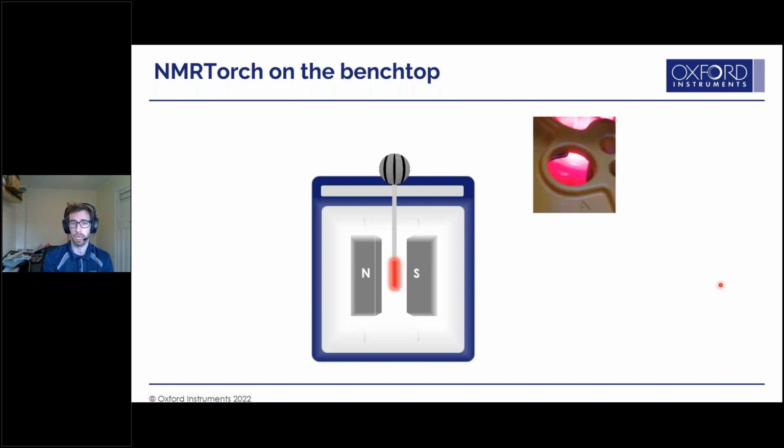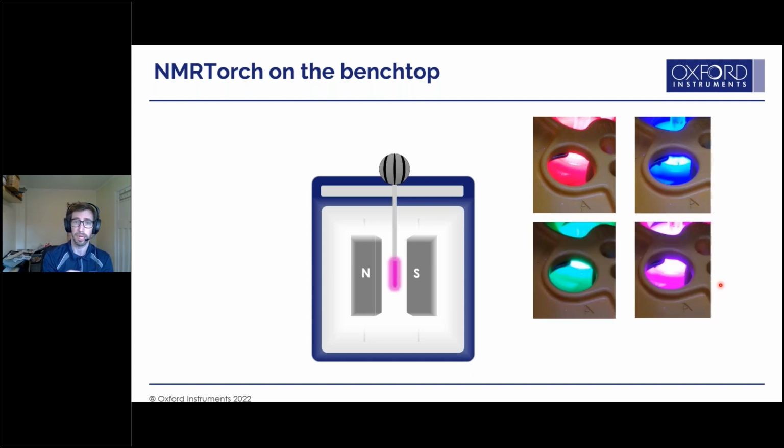And then we can change which LED we're providing power to give us red light at the sample, blue, green, or any combination of those LEDs present. And that's hugely important, as Sasha said. That allows you to provide all sorts of variations on the experiments that you're doing without having to change the setup itself or the chemistry you're looking at.